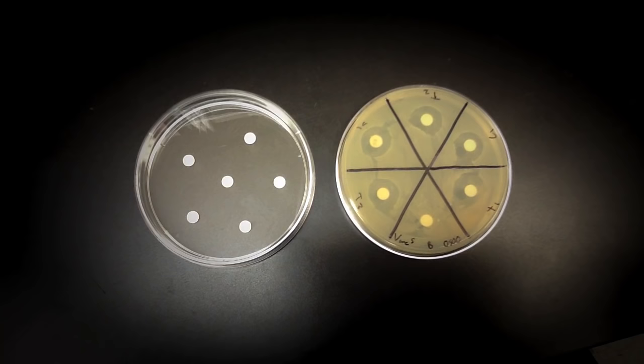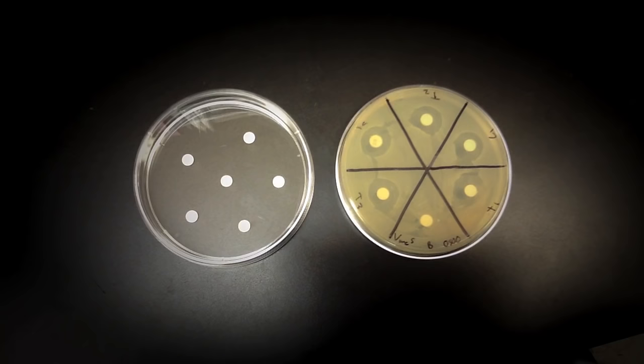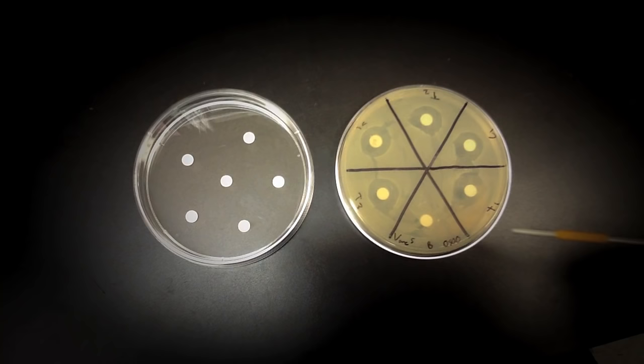In this assay, a filtered paper disc is loaded with a specific amount of antibiotic and placed on a lawn of bacteria. The antibiotic will diffuse out of the disc and into the media where it's taken up by the growing cells. If the bacteria are susceptible to the antibiotic, they will die off.